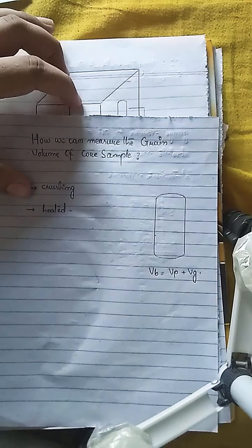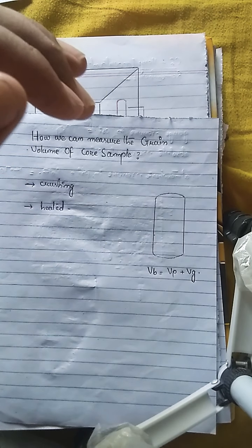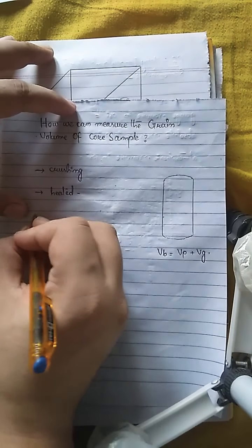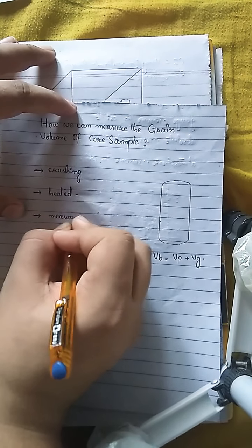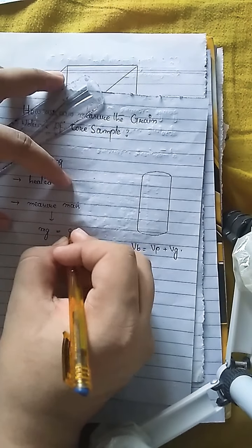We heat this core sample so that all the fluid present in the core sample is evaporated, and we can get an accurate reading of grain volume. So first we crush the core sample, then we heat it to remove all the fluids, and then we measure the mass by physical balance. This mass that we measure is basically the mass of grains of the core sample, that is, it represents the grain mass.